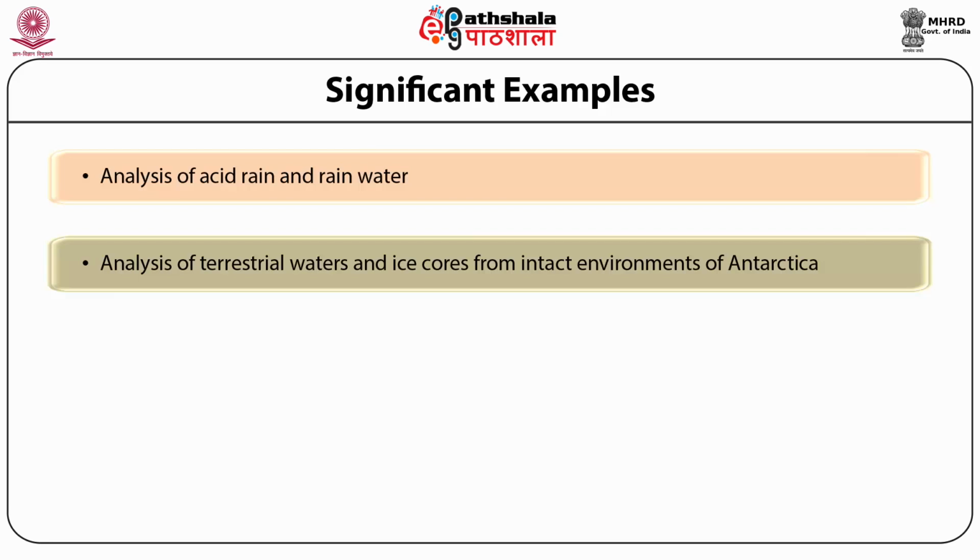The estimation of inorganic solutes, metal species from surface water bodies, and the ability to quantify different oxidation states, for example, iron, and stable complexes of metals, clarifies the potentiality of the IEC technique.